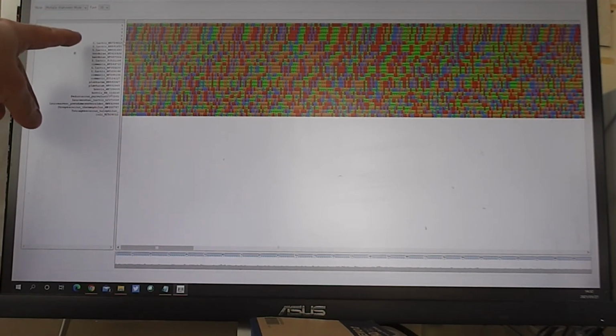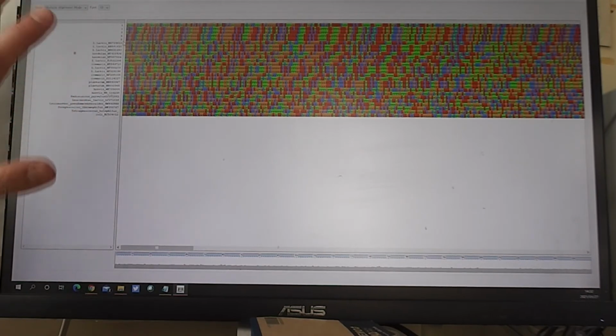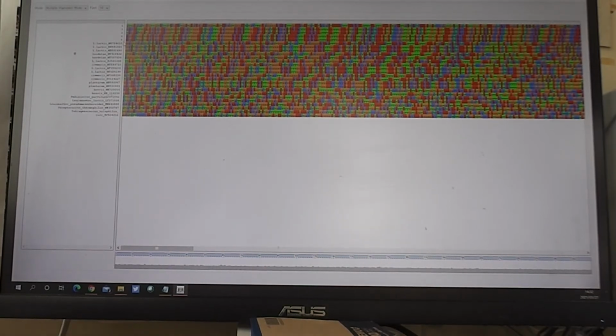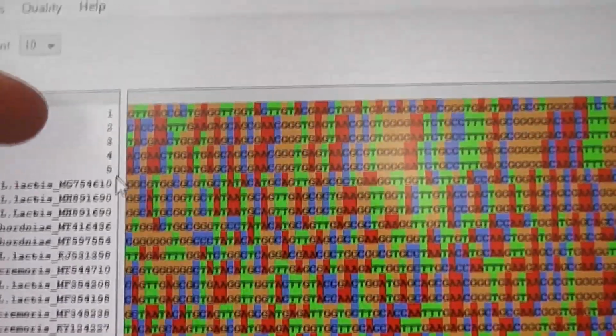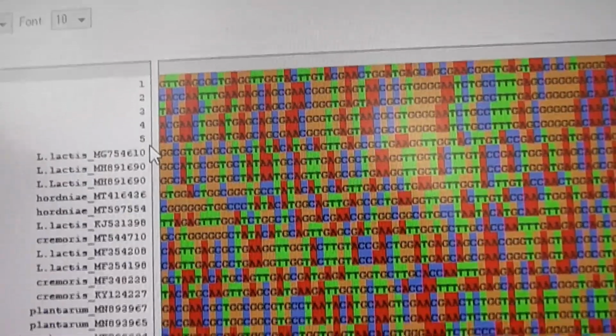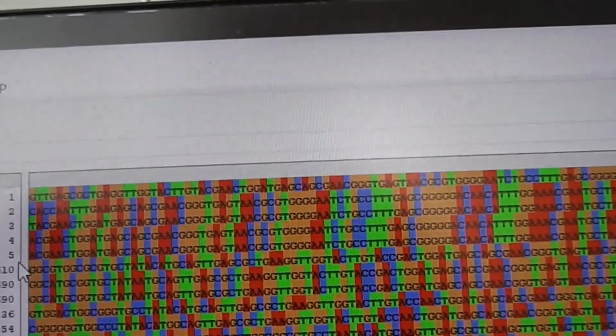And after that, the different sequence data obtained from the website of NCBI. Let's try to move. Yes, you can see 1, 2, 3, 4, 5, and the reference data like this, and each are strains, so we already succeeded in incorporating them, okay.